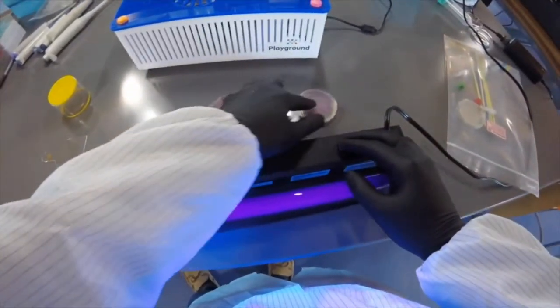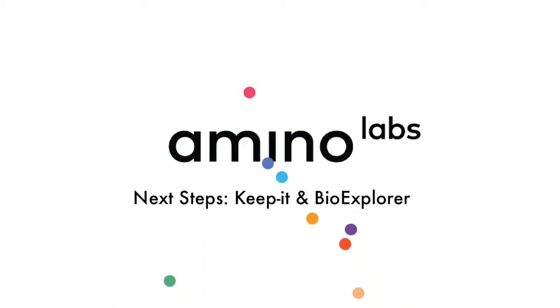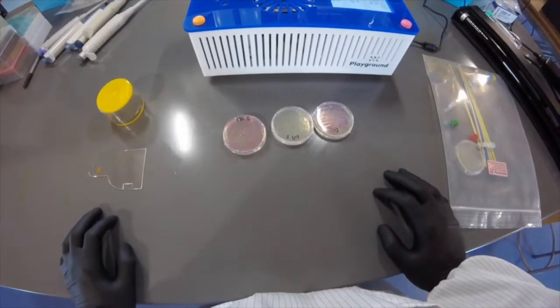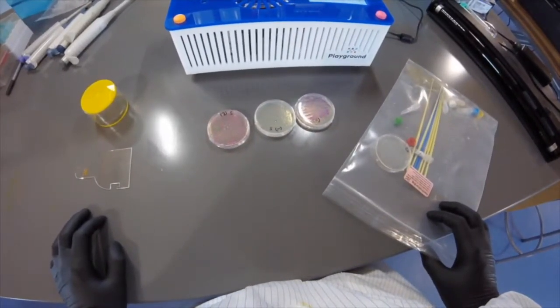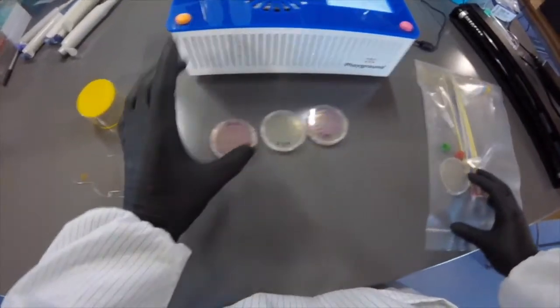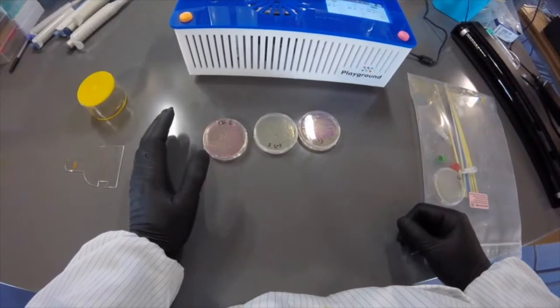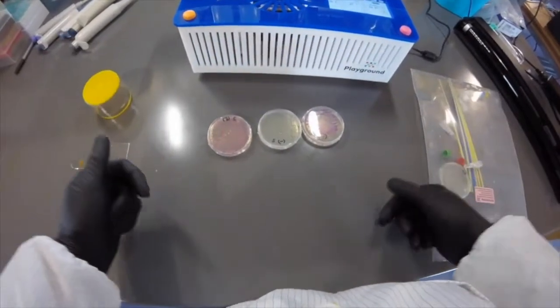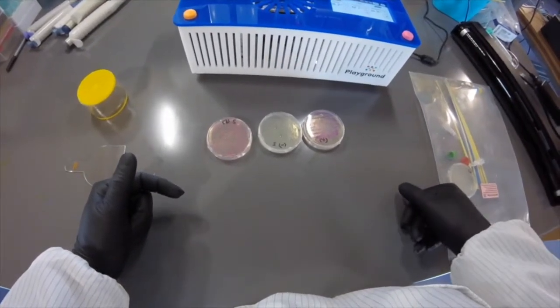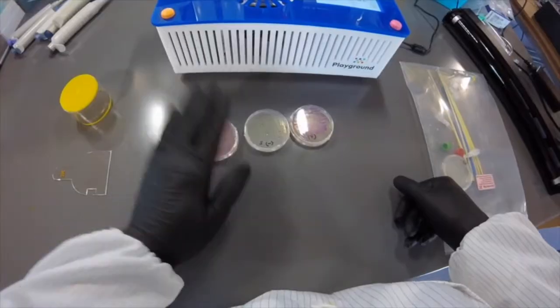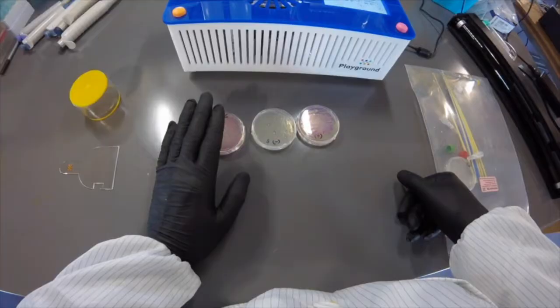Okay, so let's get rid of that—that's exciting! We're not going to inactivate this yet because we're going to do something further, what's called a keep it kit. But before we do that, I decided we'll just go ahead and start up a bio explorer, and we're actually going to brew some of our red pigments on a much larger scale.